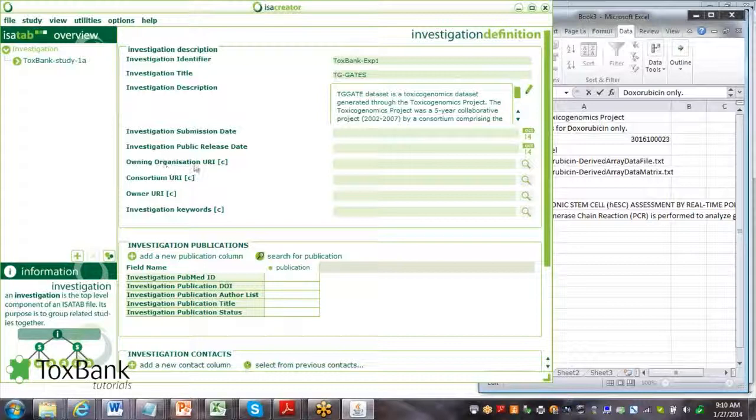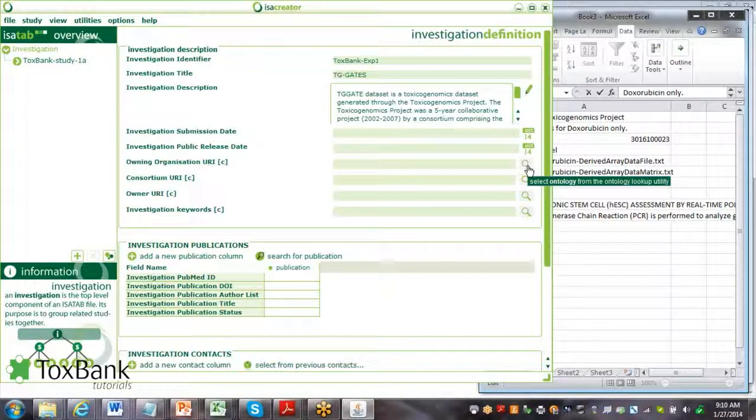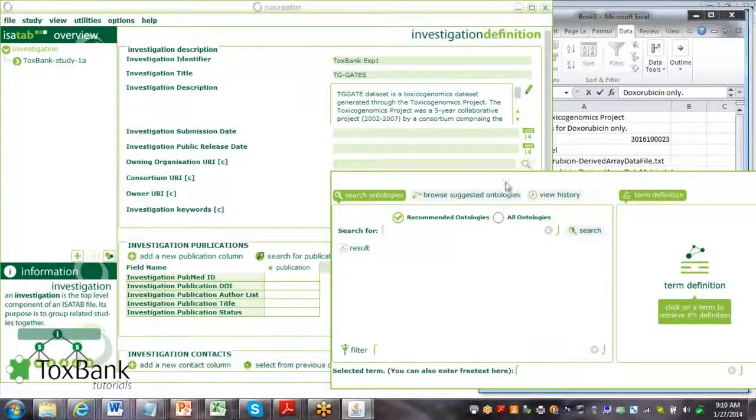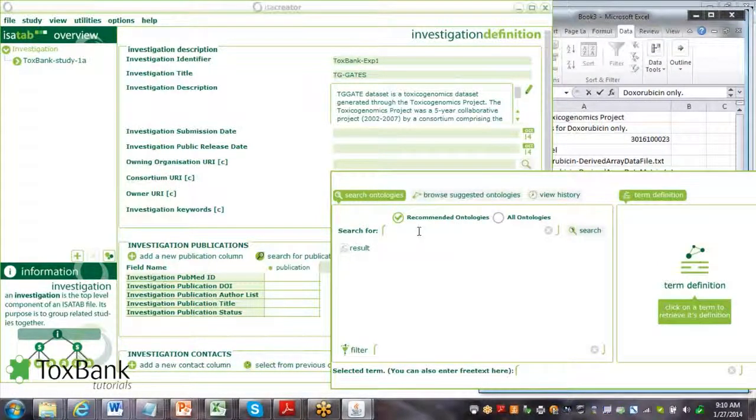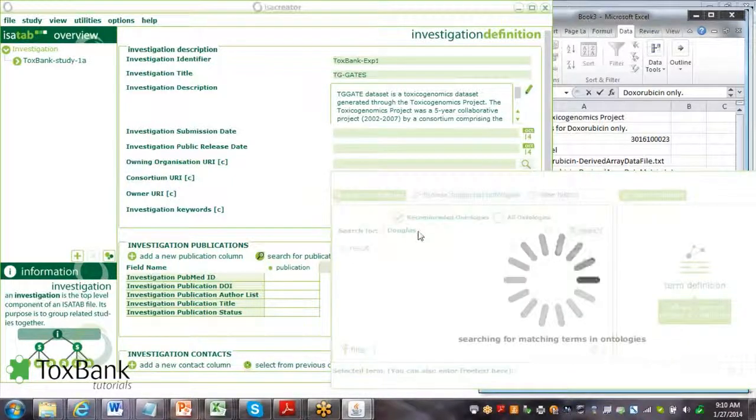Owning organization - who owns this investigation? You click on the search button. In this case, if we say Douglas Connect owns this investigation, I'm going to search for Douglas Connect in the Toxbank warehouse.